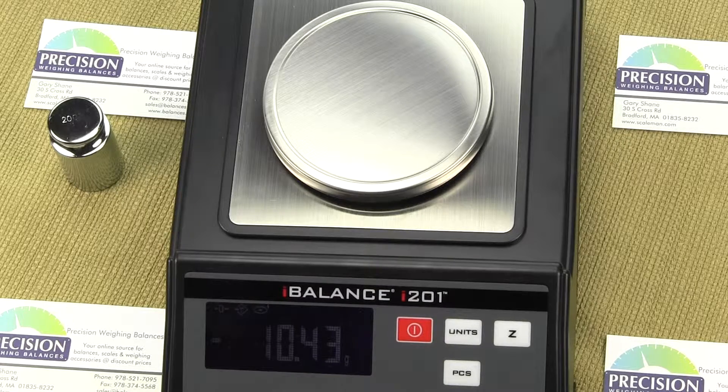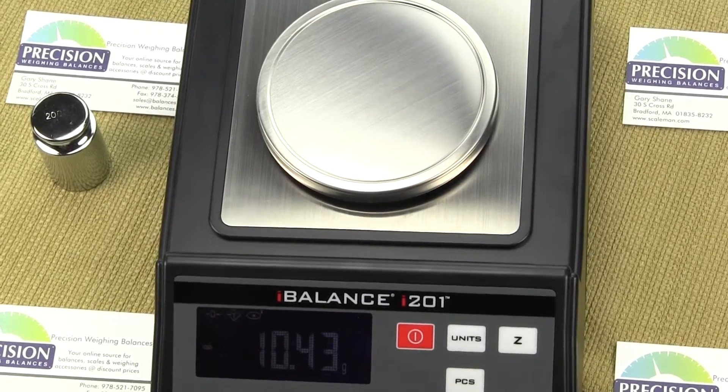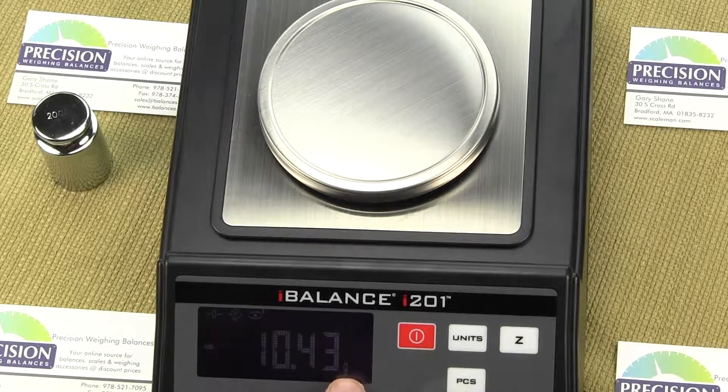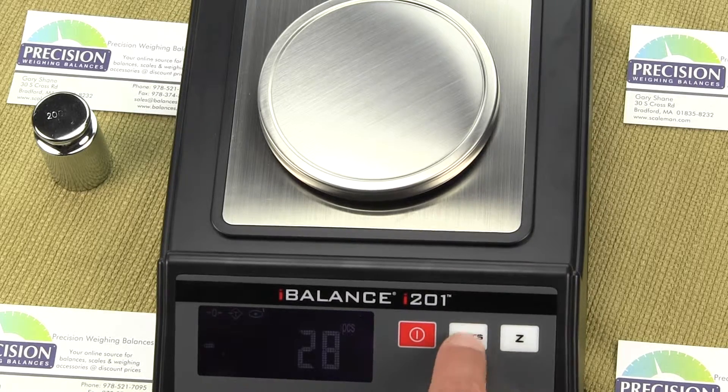Let's talk about the weight units. If we press the units key, right now we're in grams — you'll see the G in the lower right-hand corner. Pressing the unit key cycles through: ounces, milligrams, troy ounces, pennyweight, grains, and then back to grams. If you power down the scale, it will power back up in the last unit of measurement used. With the i-201, if you power down in ounces, it will power back up in ounces — many other scales default back to grams.